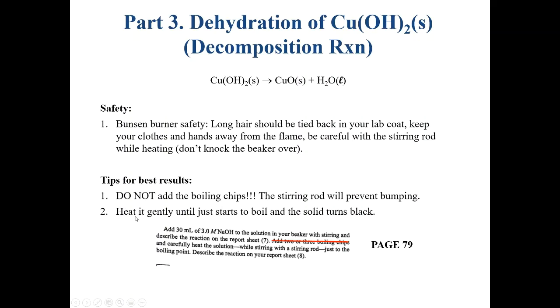And then another thing is you'll notice that they heat this, and when they're heating it, they do it gently because they don't want the solution to boil. The main reason why they don't want the solution to boil is so that you don't lose any of the copper oxide. So one thing that you'll want to think about as you're going through this video is, where could these people that are doing these experiments make mistakes?